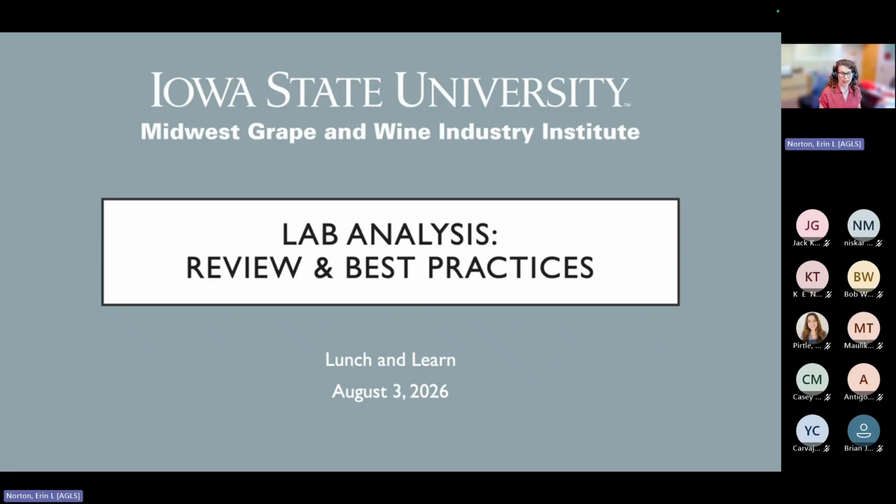But today I wanted to go back to some basics and talk about lab analysis. There's a lot of lab analysis we do around berry maturity and around harvest time. I know a lot of us have done these things many, many times, but it's always good, even for myself, to go back and review the proper techniques and best practices. It's really easy to cut corners for lab analysis, and I'm here to remind you that sometimes that's not a great idea. So this is primarily focused on lab analysis you're going to do during the harvest season.